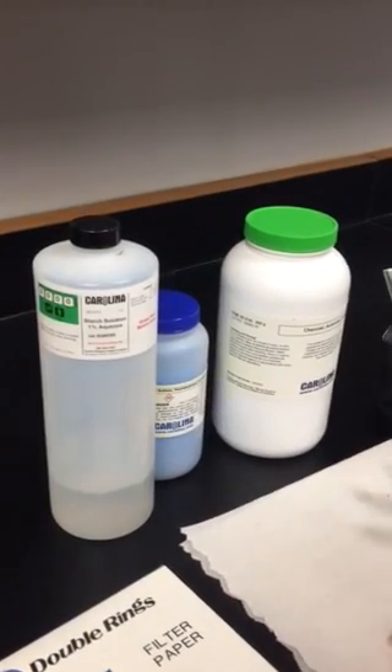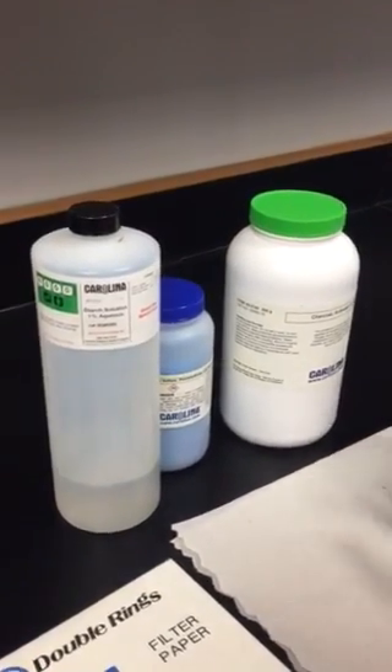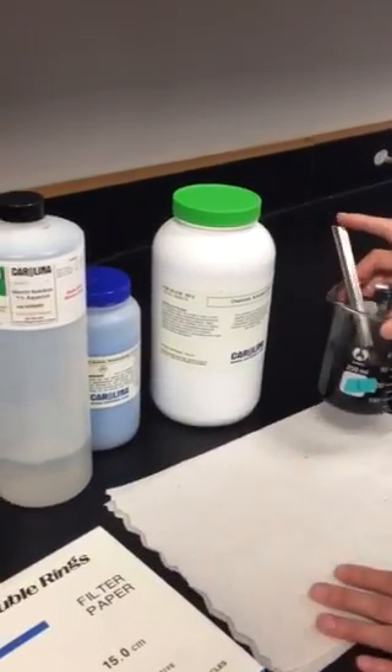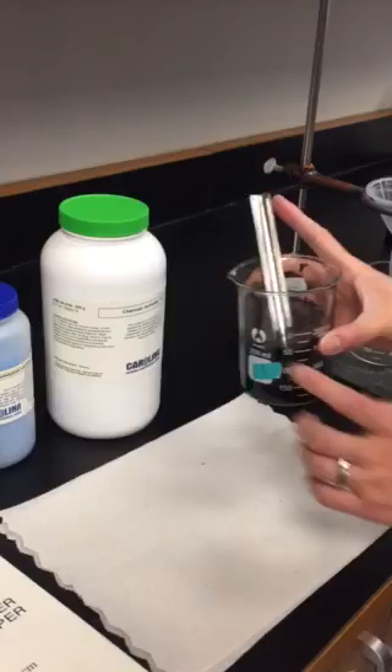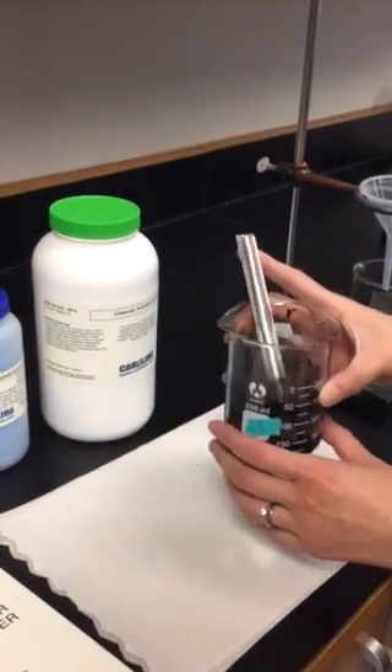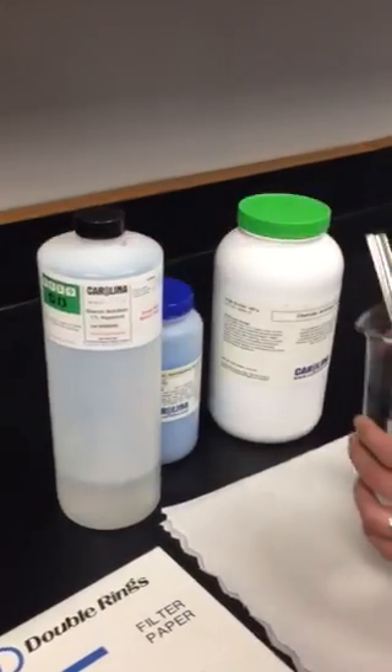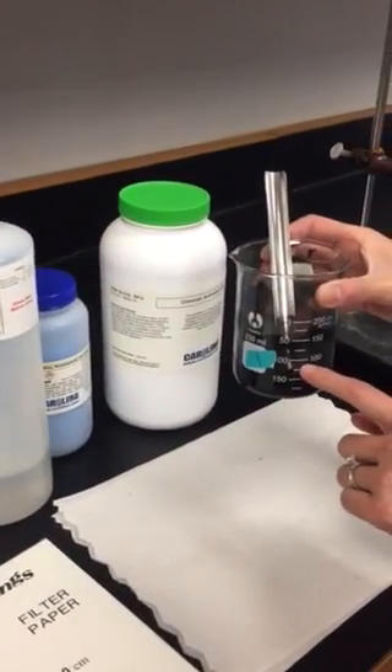This is the filtration experiment. First we're going to make the solution. It's pretty simple. You just grab a 250 ml beaker and then you're going to add 100 ml of the 1% starch solution to the 100 ml line.